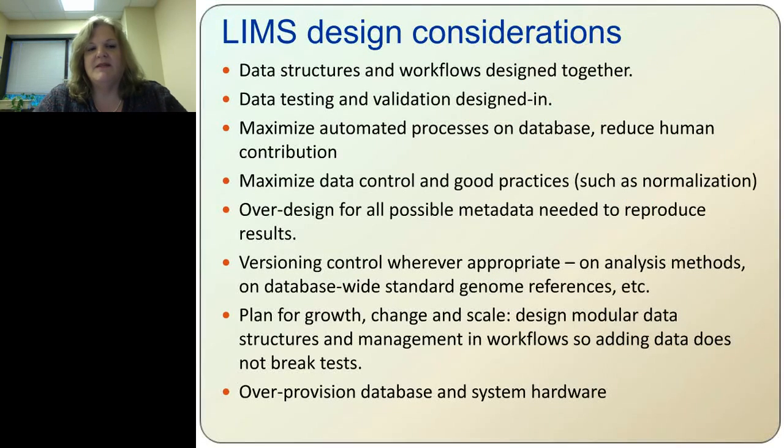When we designed the LIMS, we had different considerations. When you design a LIMS, you have to consider whether your data structure and workflow should really be designed together. It's hard to design your data system first and then build a workflow on top of that, and vice versa. It really should be hand in hand. We designed data testing and validation into the system, so the system has as much testing and data validation built into it as the code that's built in to manage the data.